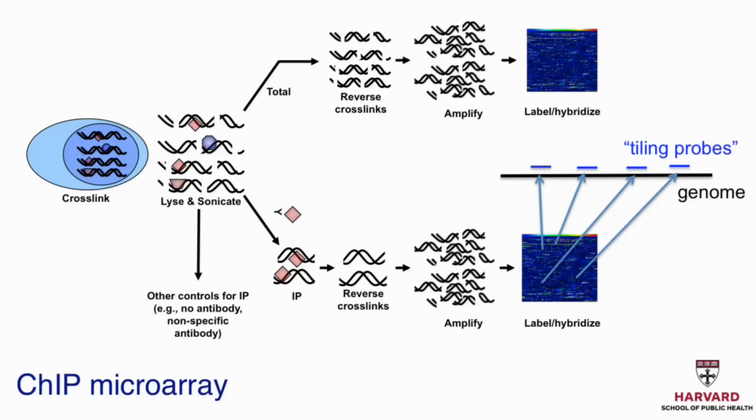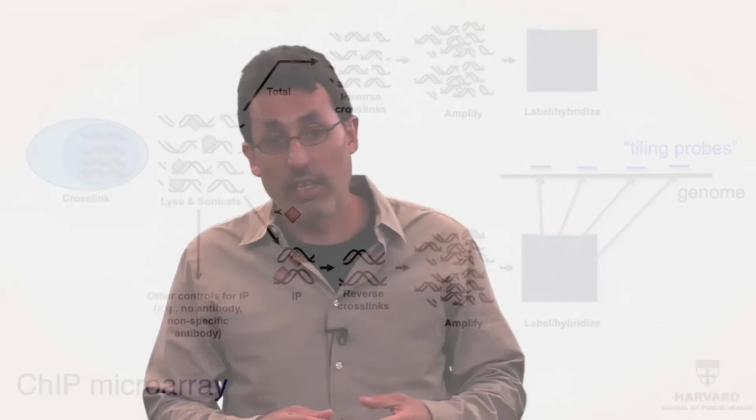So we've learned 3 applications of microarrays. There are others. In this class, we're going to see the data produced from these techniques, and knowing how they were produced actually helps us make decisions about how we analyze the data.